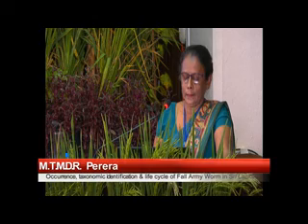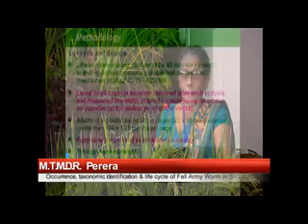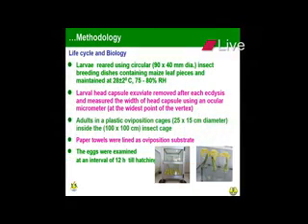The cage was placed inside another container to prevent larvae from escaping from the lab. Paper towels were lined as the oviposition substrate. The eggs were examined at an interval of 12 hours until hatching.